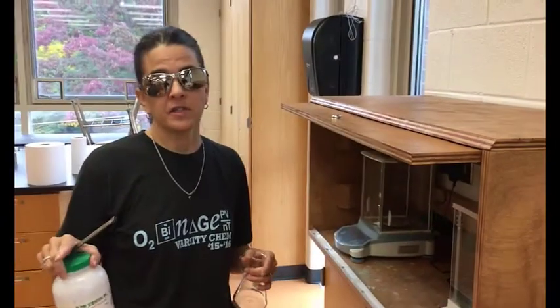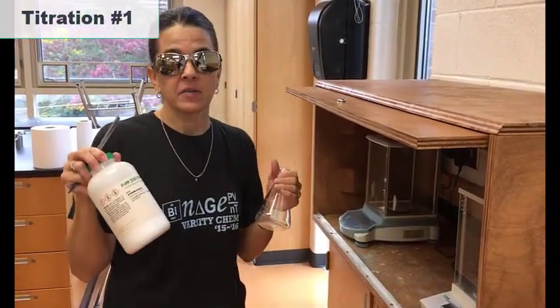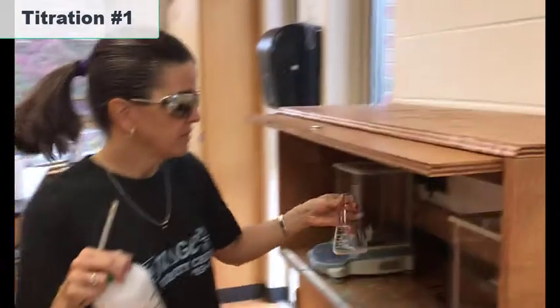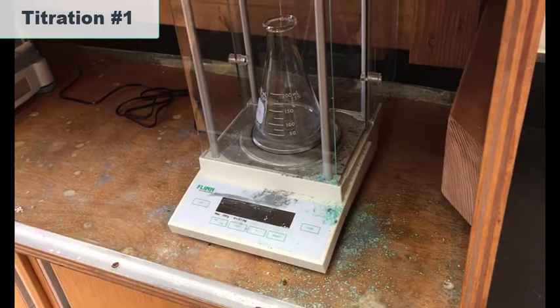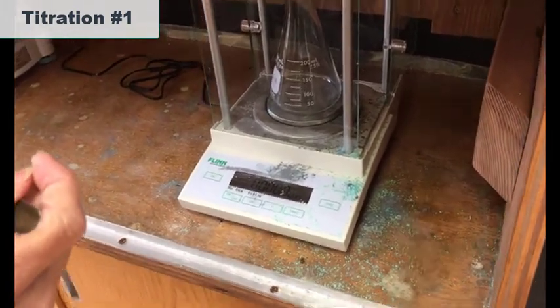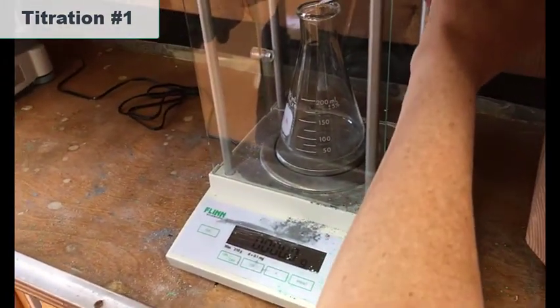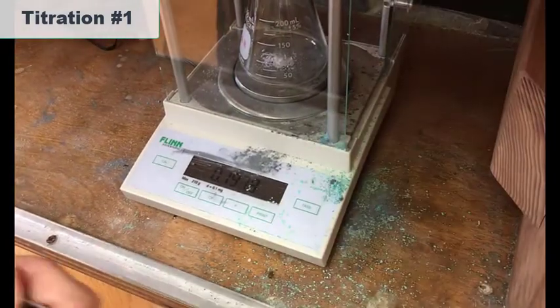Okay, in order to do our first titration, where we determine the concentration of the potassium permanganate, we need a very accurate solution with a sodium oxalate ion in it. So we're going to start with our flask. I'm going to zero it on the balance. And I'm going to attempt to put just under 0.2 grams of sodium oxalate into my flask. That may be good enough for us right now.